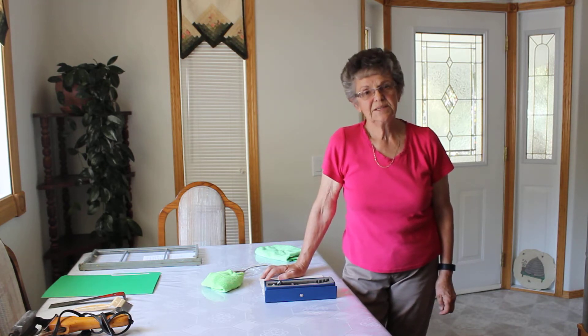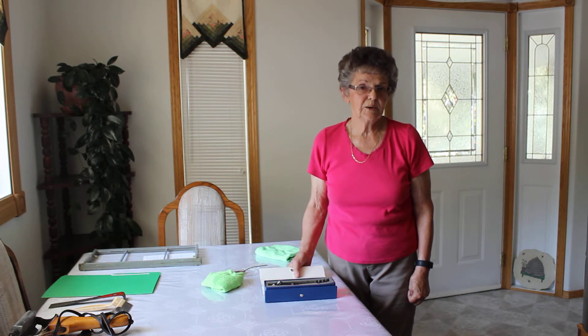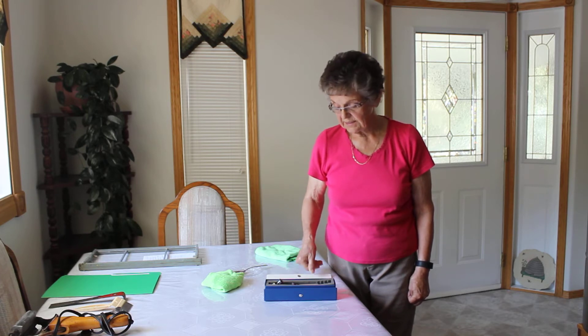Good morning, my name is Doreen Bradshaw and I am renting the extractor for the summer of 2017. I just wanted to tell you about the refractometer. It is part of the rental agreement for our members to use when they are extracting honey.